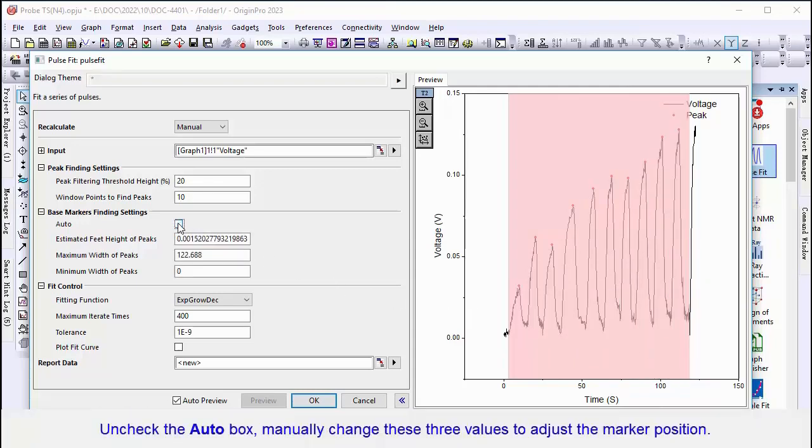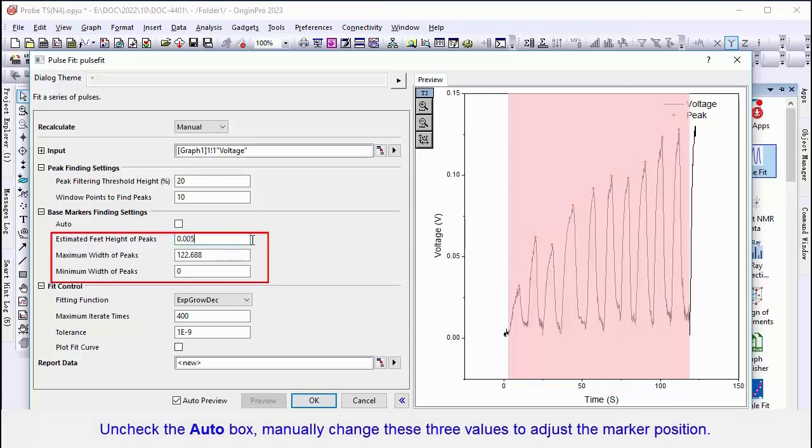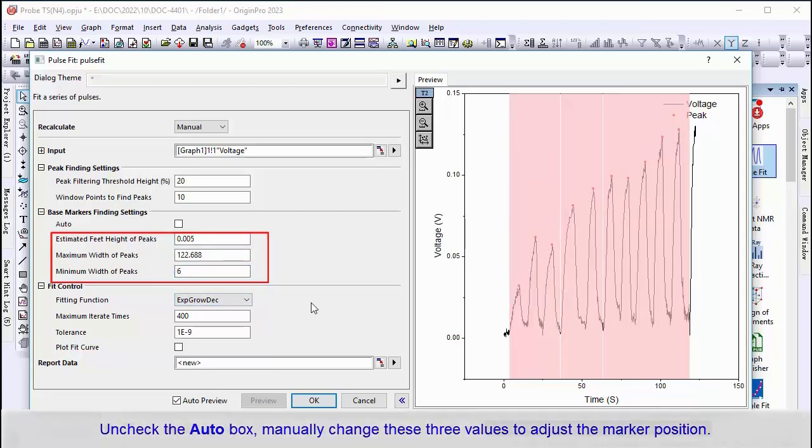Uncheck the Auto box to manually adjust estimated feet height of peaks, maximum width of peaks, and minimum width of peaks to find base markers.